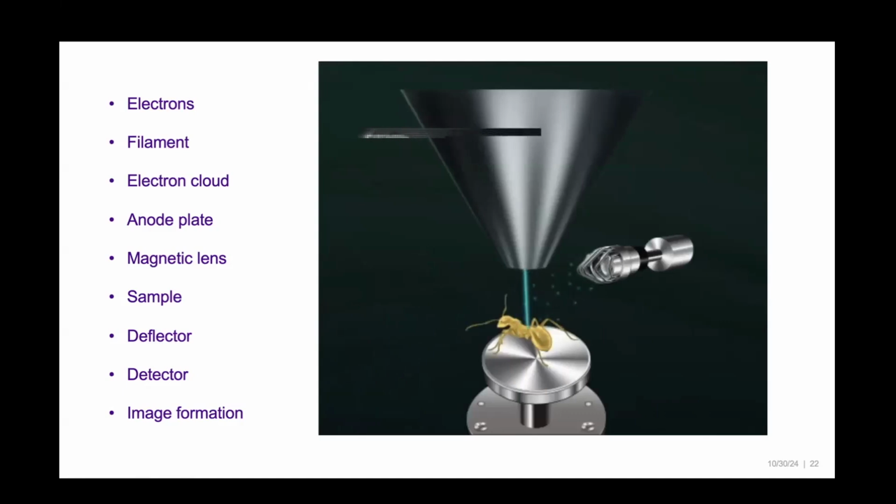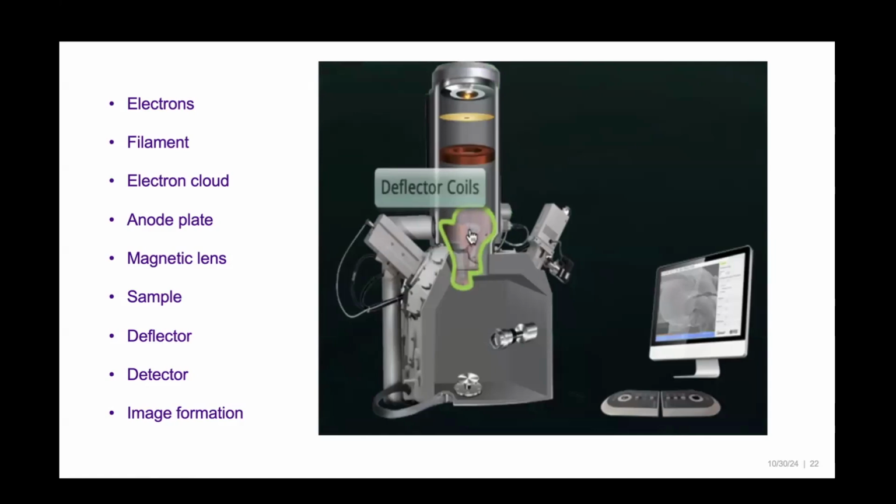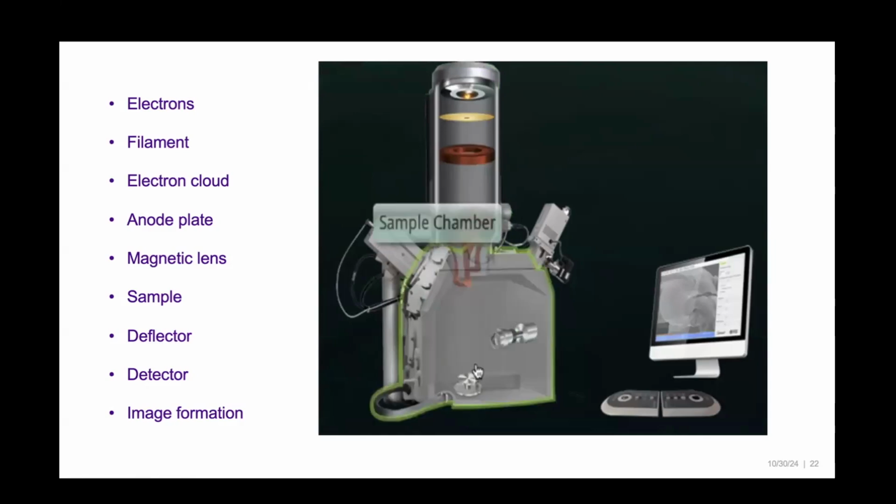When there is gray, that means there are maybe little details, bright means there are a lot of structural details. So it distinguishes, because when the sample interacts, it has to detect where the structure or details are.